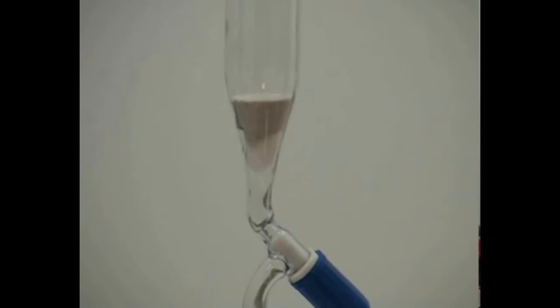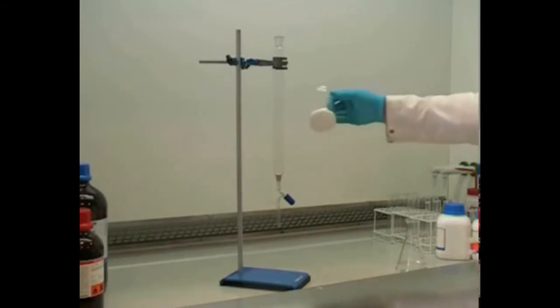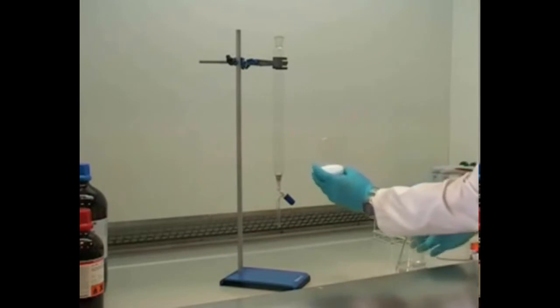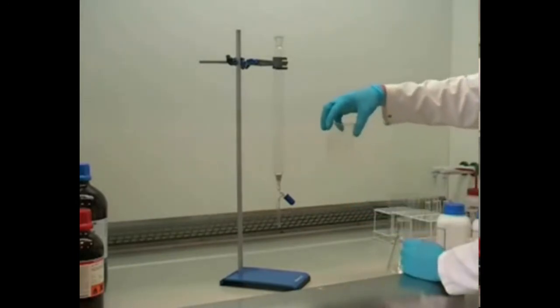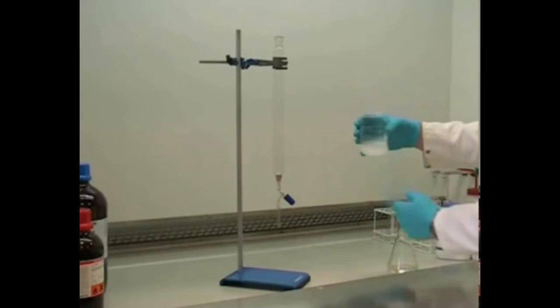Here you can see the sand forming a level surface on top of the cotton wool. We then take the appropriate amount of silica in a beaker, and this is then made into a slurry using the solvent we're going to run the column with. This solvent is known as the eluent. Here you can see us swirling the silica with the solvent before pouring it into the column very carefully.